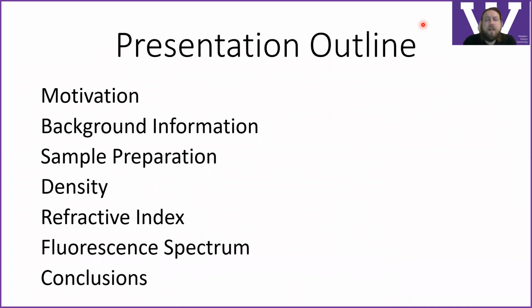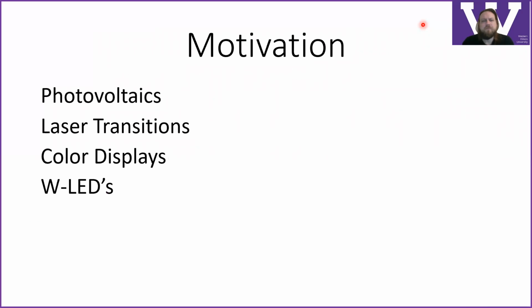So what can you expect today? First, I'll tell you about why we do this work, give you a little bit of information about glasses and what it means to be a glass. I'll show you how we prepare our samples, and then I'll talk to you a little bit about each of the different measurements that I make on these glass samples and what that means to us.